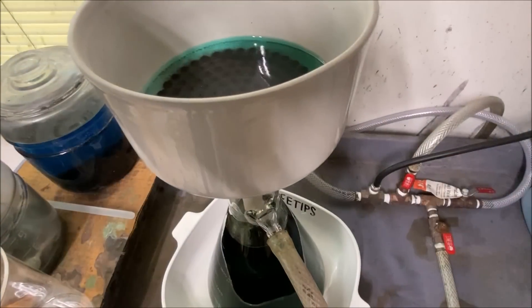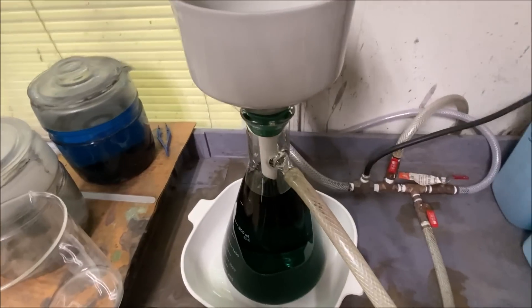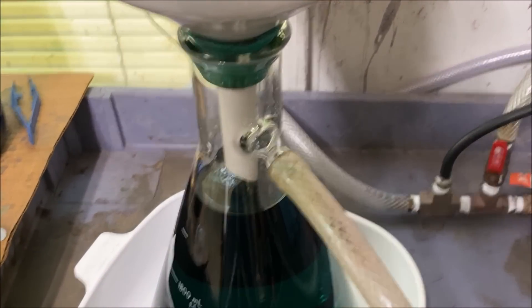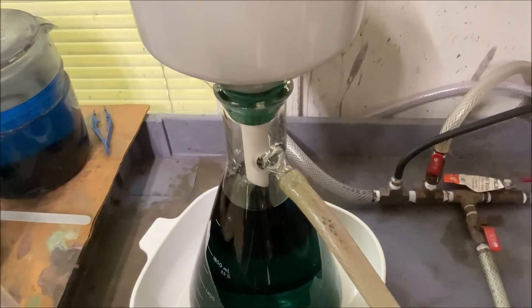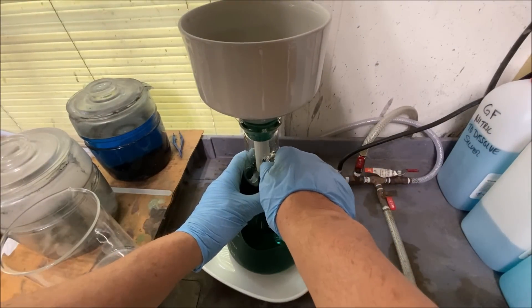We've still got some solution left in the funnel — not much — but we might make it. Getting real close to being too full. Let me show you what we do in a situation like this. Normally I just pull this off, take the funnel, put it in a beaker, and set it off to the side.